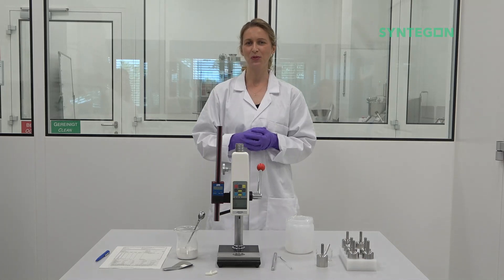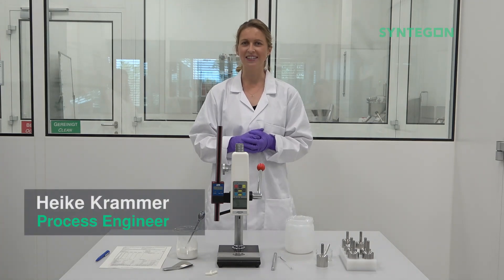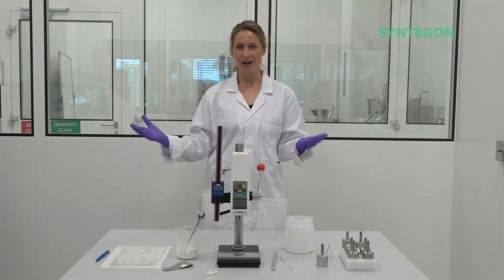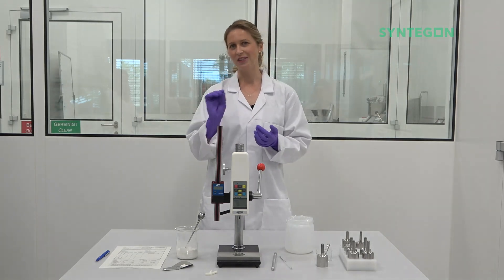Hello, welcome to our OSD Customer Center in Waiblingen — to the OSD Tech Bites. My name is Heike Kammer and today we are at our lab, where we will do together a tamping test with the tamping test device to determine the dosing disk height.